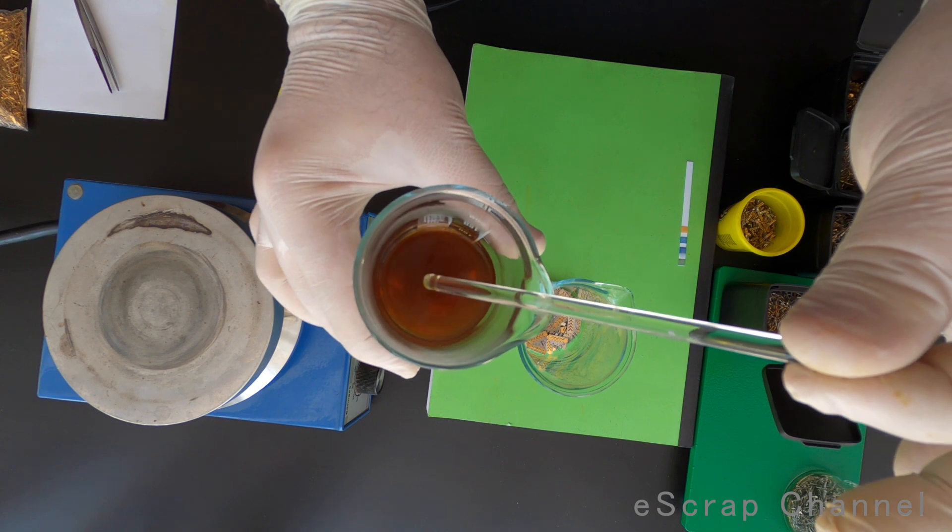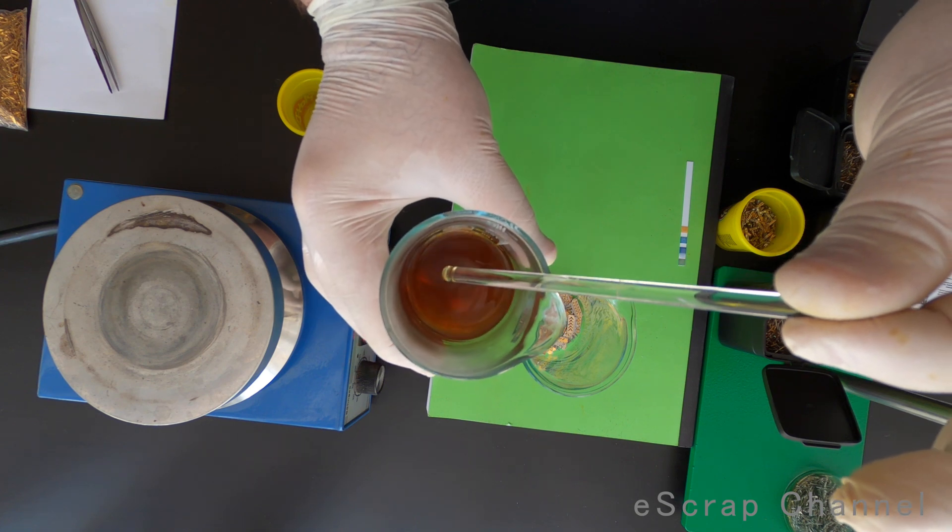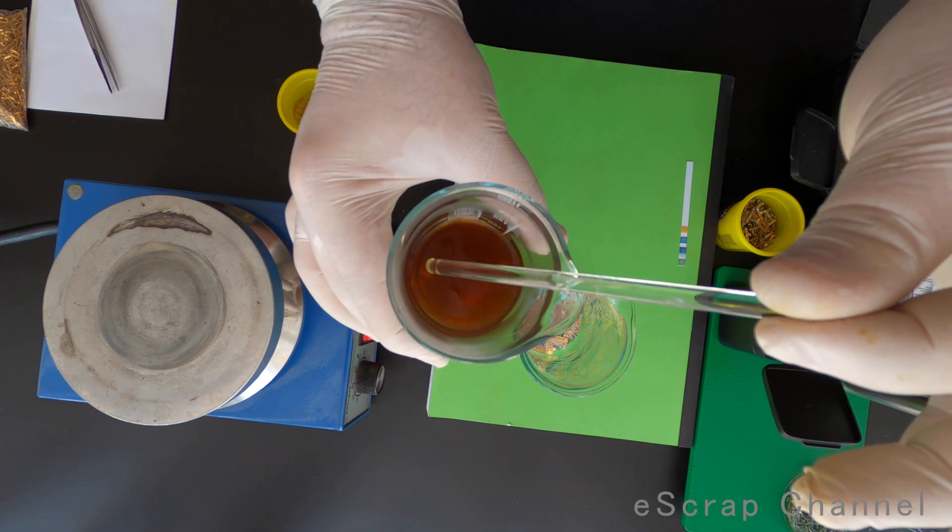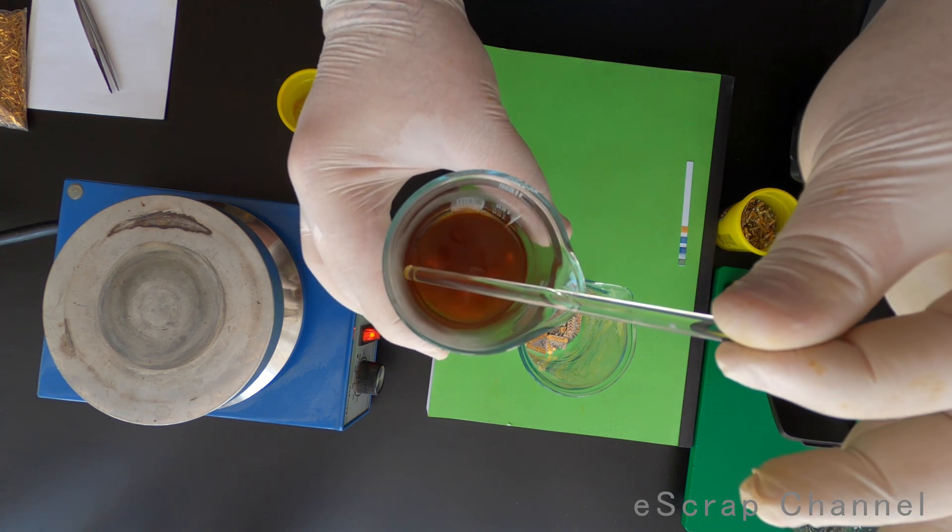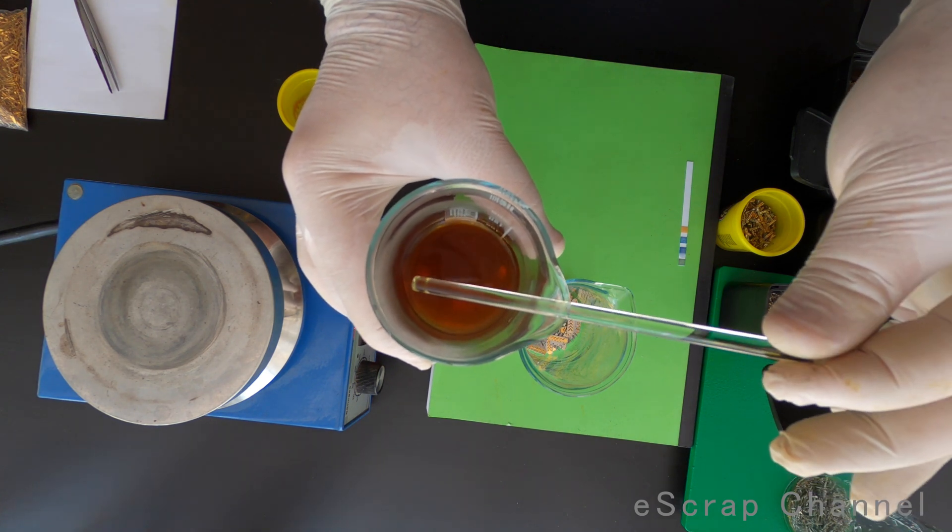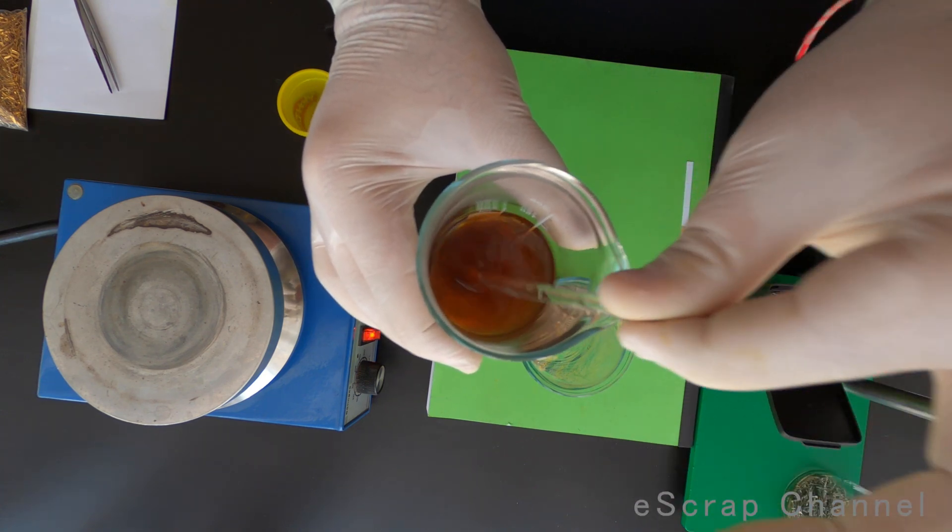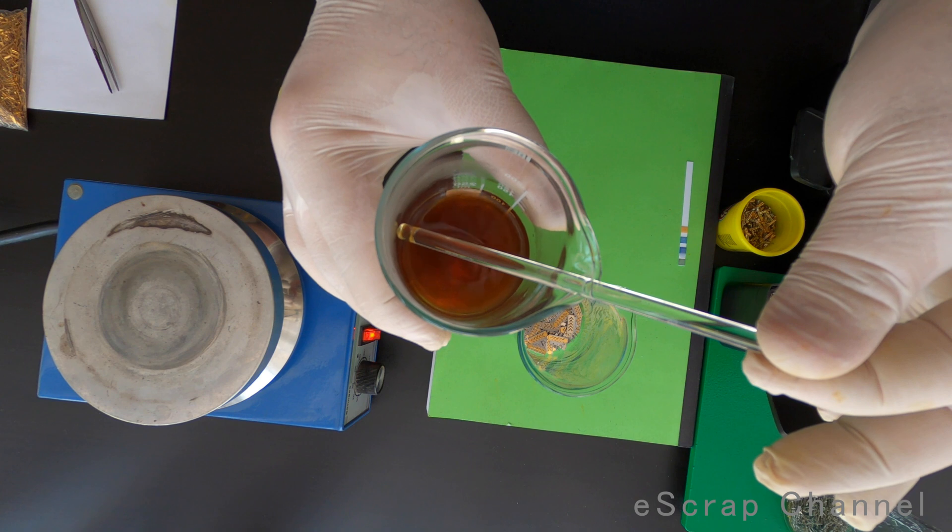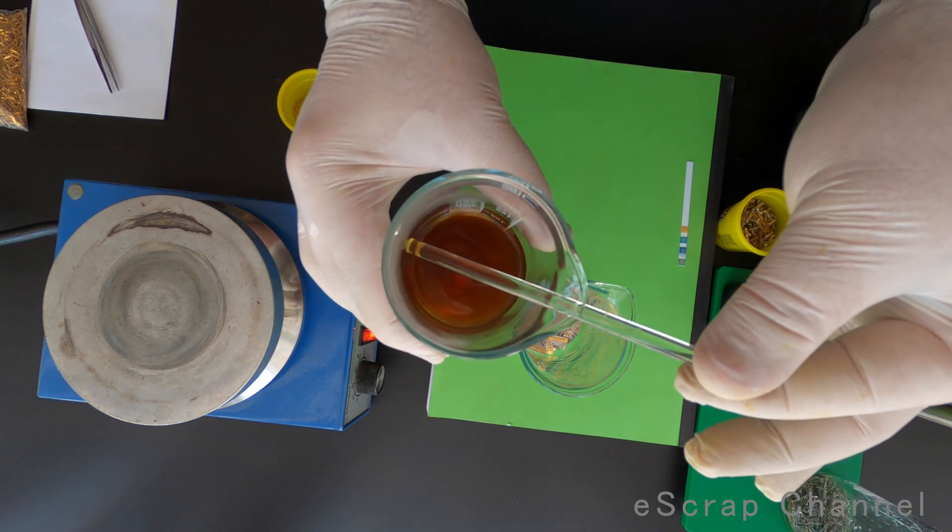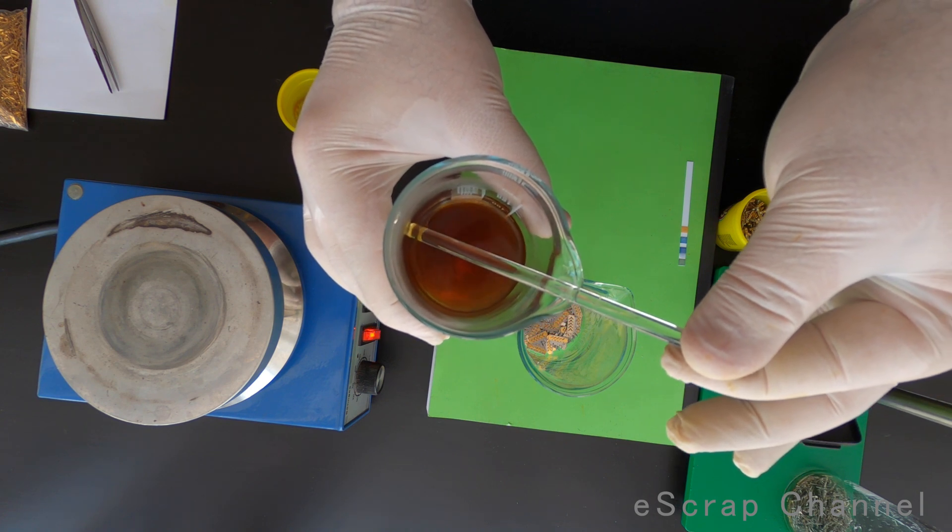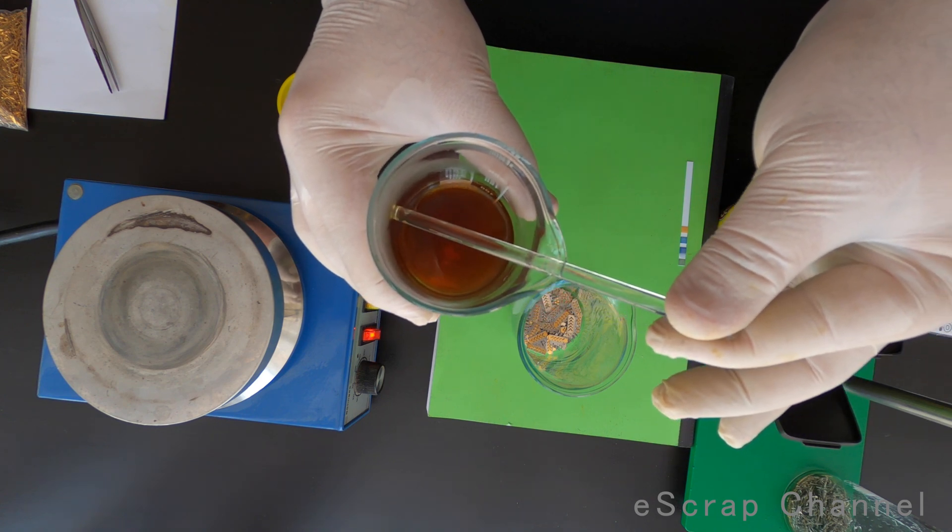If I can recommend you something, please always separate your pins when you collect them from the electronics. Because in this solution now, I have pins that have different thickness of the gold plating and they dissolve with different speed. So some of them are already white, some of them still have some gold on them. It's a little bit not efficient process to mix the pins. Usually I separate them in small bags. And when I process them, I process them in batches.